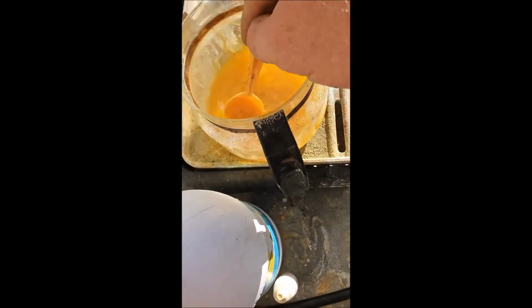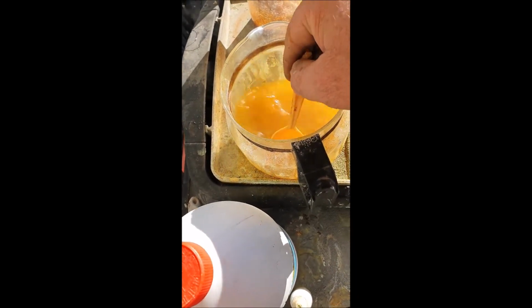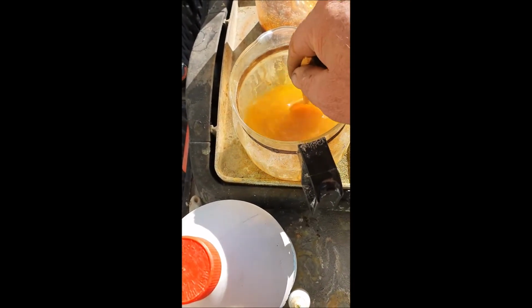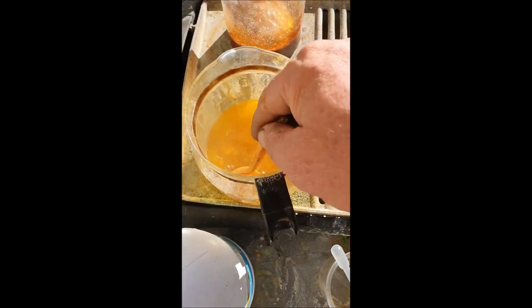I'm just trying to break up the filters. They're crumbling up now. That's what I like about these filters, they fall apart in AR. Coffee filters don't tend to do that too much. Look how orange it is. It's going to be nice.